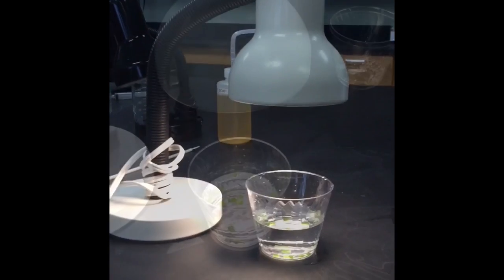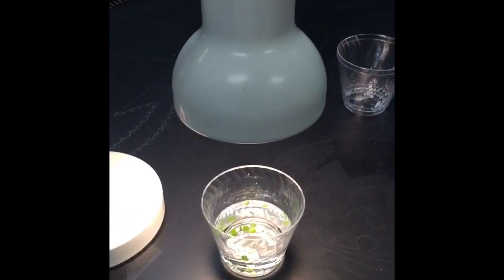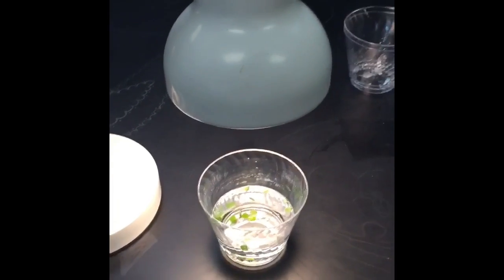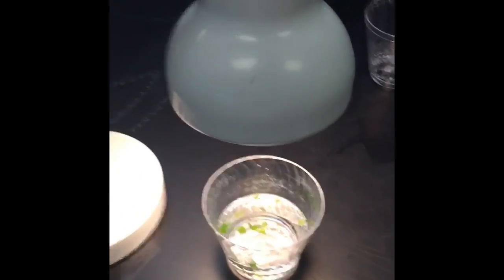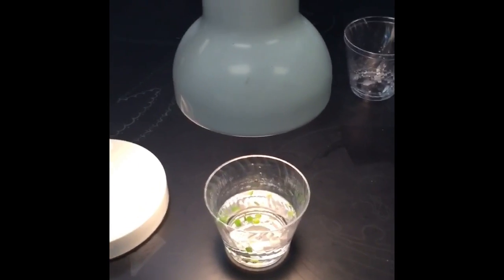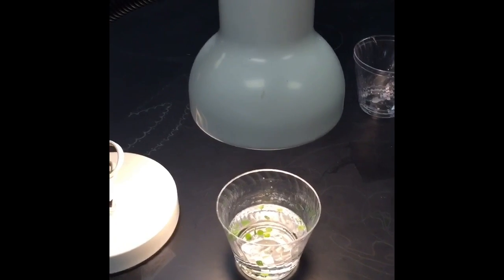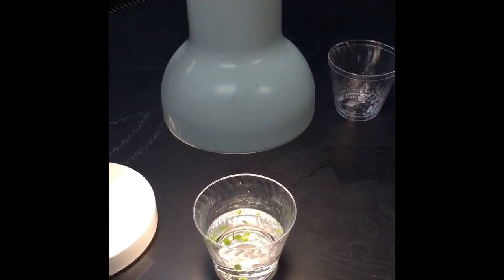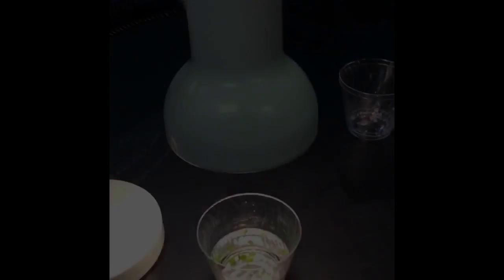Ruler was not needed. Phone is dying, but we're on the second trial, which is double the bicarbonate, and they are floating much faster. It's only 5 minutes in, and we had 8 that have risen. So, data shows that the water was the slowest, the regular bicarbonate was in the middle, and the double the bicarbonate is the fastest and most photosynthesis producing.